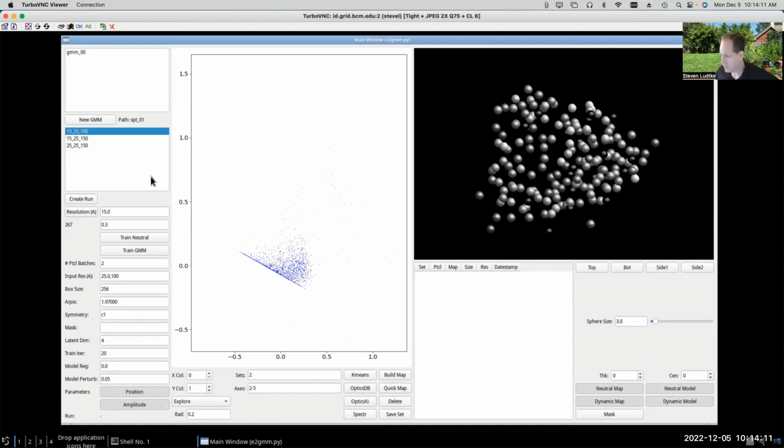The advantage is that you just processed it, so hopefully you have a good reconstruction of it already, and it was done using EMAN2, and it shows that you can actually do this analysis now on tomographic data, not just single particle data. If you have some other project where you've done an old EMAN2 style or new EMAN2 style single particle refinement, you could use that data set with the tutorial instead of this data set.